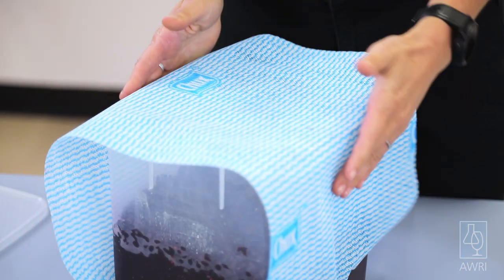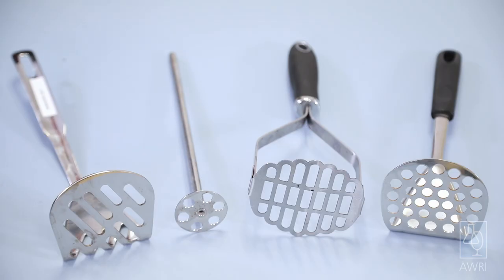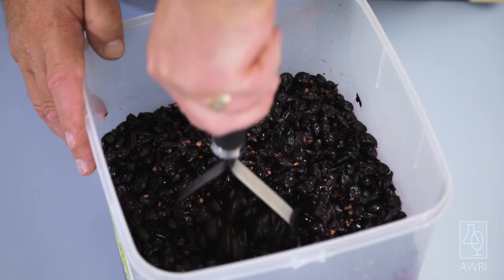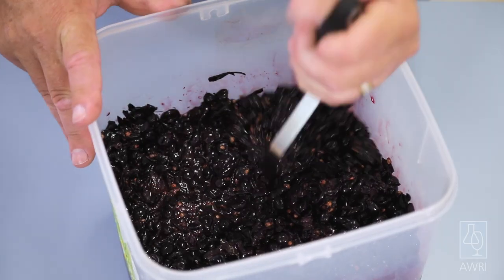A cheesecloth will also work. When choosing a container, keep in mind that some room is needed for plunging and mixing, but headspace should be kept to a minimum. Crush the grapes in a bucket using something like a potato masher. The AWRI recommends conducting all small lot smoke ferments on skins, regardless of whether the grapes are red or white. This provides maximum extraction of any smoke compounds, giving the best indication of smoke taint potential in the grapes.